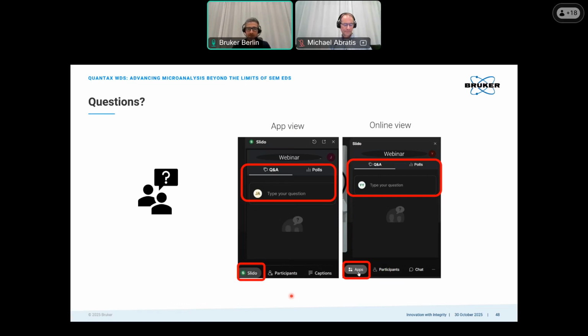So there is a question for you, Michael. How long does it take to do a mapping for the sample at page 35 with WDS? Maybe we need to go back to page 35.